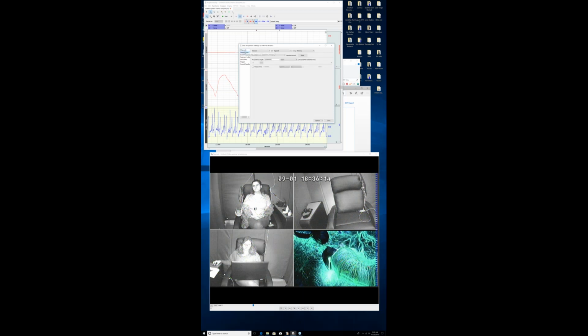So one of the things we recommend is coming in to set up data acquisition. AcqKnowledge is running as a 64-bit application, so it can handle really large files, but we typically recommend that you try and keep the files to a manageable size. So if you can set the system up to record, I'm going to give you an example.